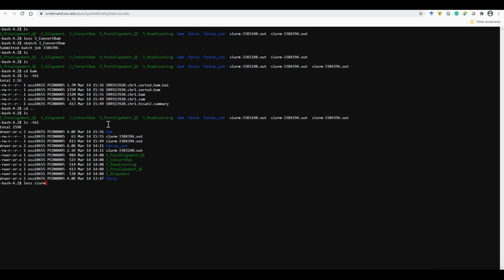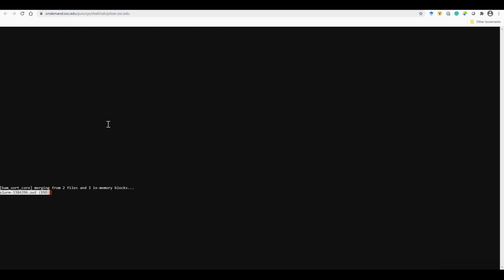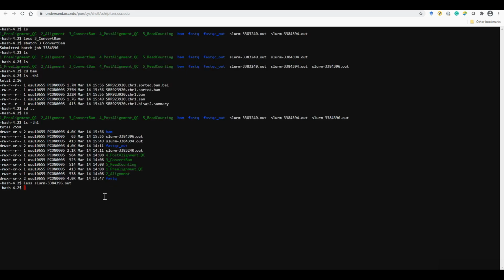Let me look at the output file. Okay, and let's submit job 4.